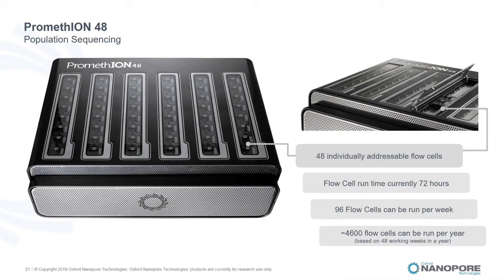You can really run them independently, so you don't need to wait for other people's data. If you have the data, you can start running one flow cell. And when the next sample comes, even during the run, you can set up a new flow cell and run sequencing. DNA runs and RNA runs can go in parallel, all in real time. If you notice one of the flow cells is running poorly, or the library seems to be not good, you can just stop that one, wash the flow cell, and reload it.